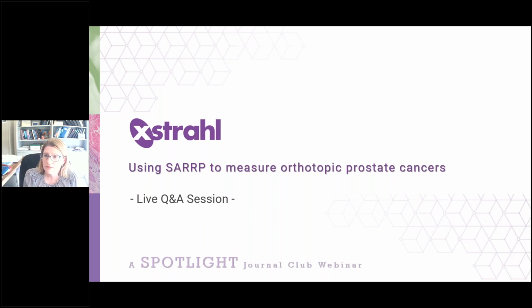Thank you. There are definitely reproducibility issues with BLI. However, it is also measuring a fundamentally different aspect of the tumor, viable cells that are translating the reporter, as opposed to the overall tumor volume, which may include areas of stroma, necrosis, or non-viable cells. Did you correlate imaging results with tumor histology?